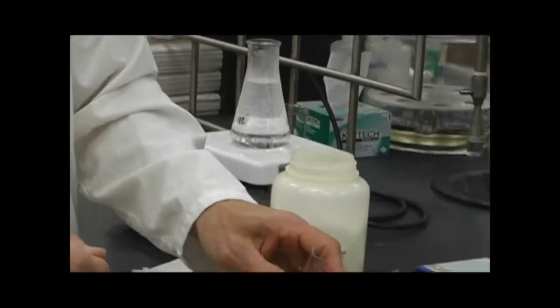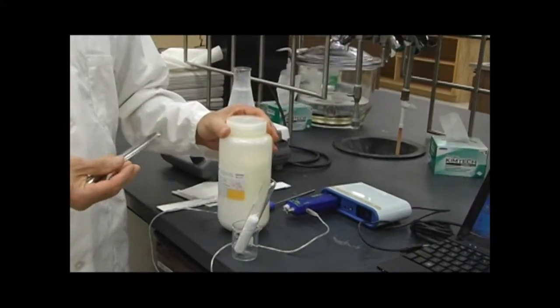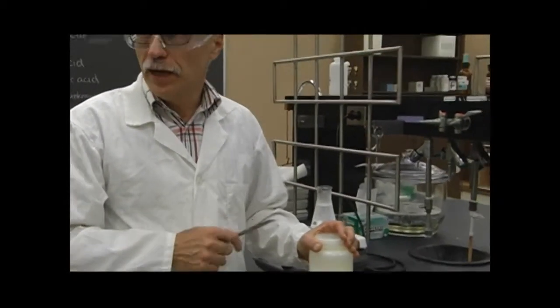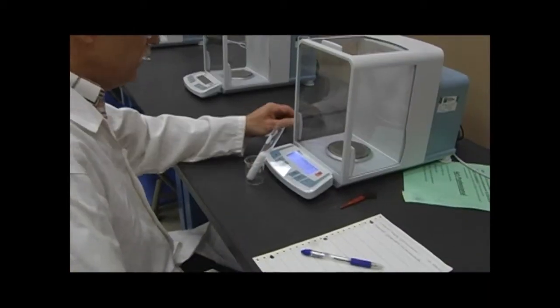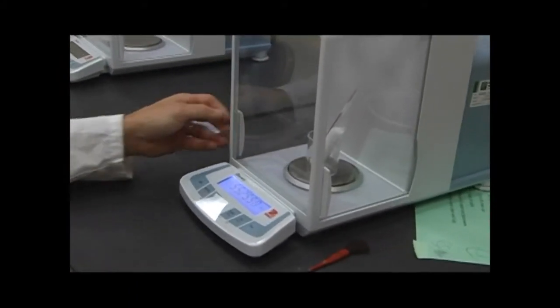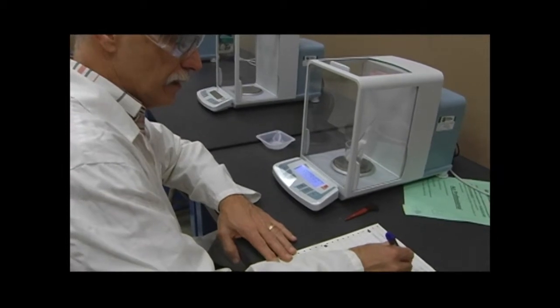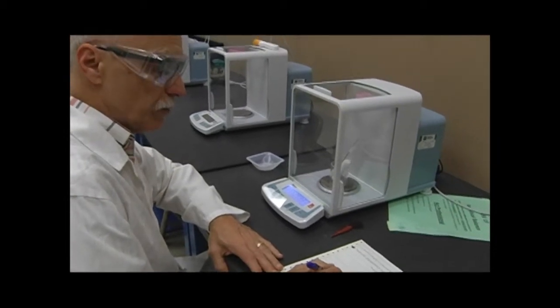Okay. So we'll take that back, weigh that, and then we'll do the subtraction to find out how much lauric acid we have. We need to know the amount of lauric acid, because freezing point depression is dependent on the molality of the solution, which is moles of solute over kilograms of solvent. So now we bring back our glassware with our lauric acid. Place that here. And then you'll do the subtraction to get the mass of lauric acid that you're using, in order that you can use it in the freezing point depression calculation.